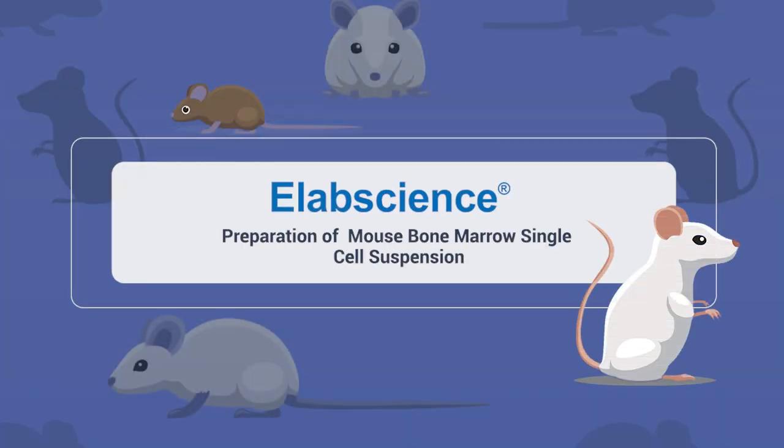Preparation of mouse bone marrow single-cell suspension. Preparation before experiments.